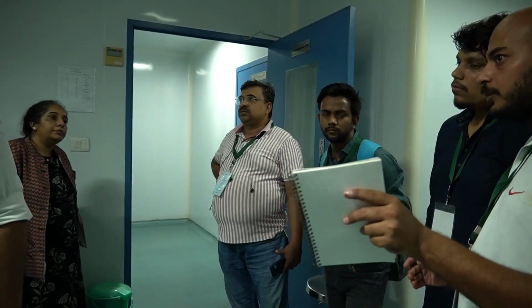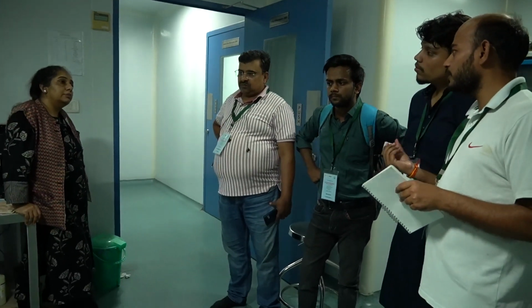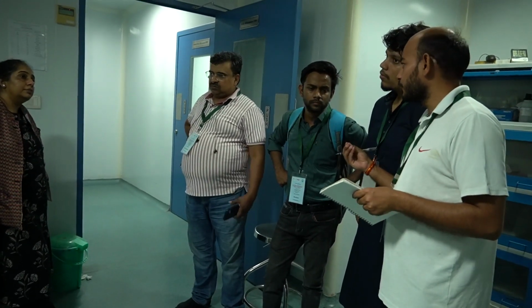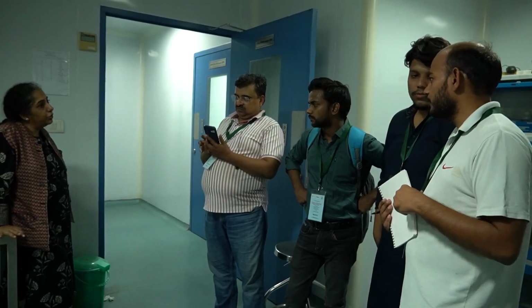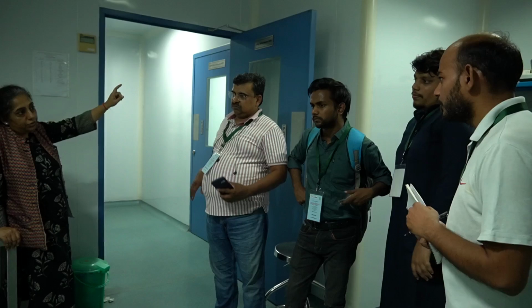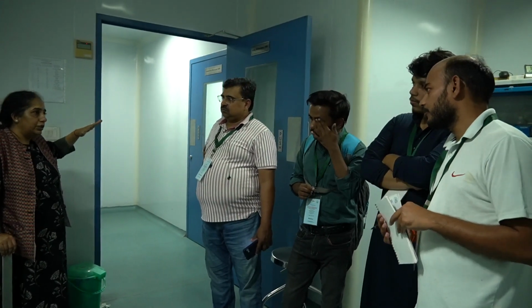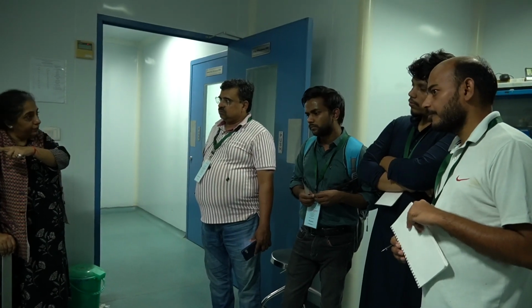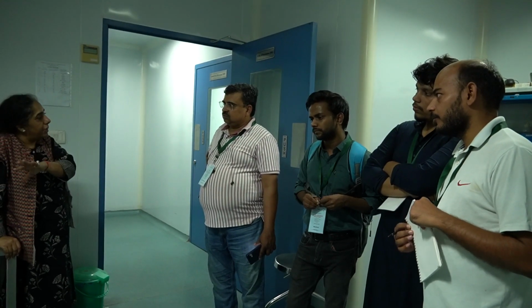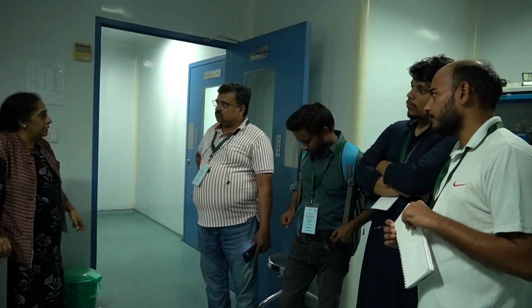After XRD, is it possible to analyze our sample with any other technique? Yes, because XRD is not a destructive technique. But sometimes, as you have seen in the FESEM, you need to do gold coating or silver coating if the sample is not conducting. So first we try to go for XRD, and if the sample is not conducting, then we go for gold coating and then do the FESEM.